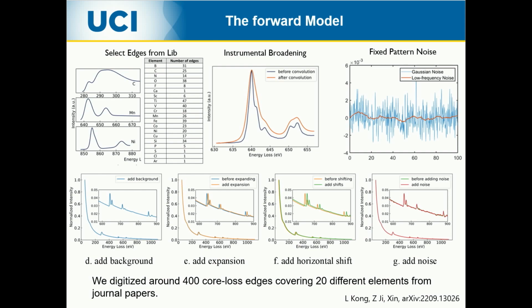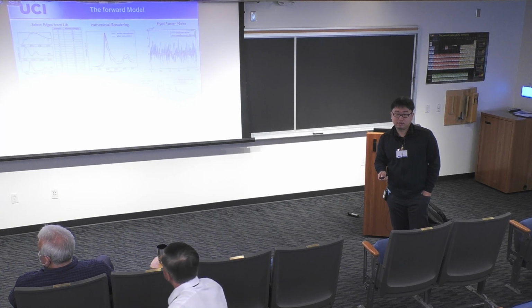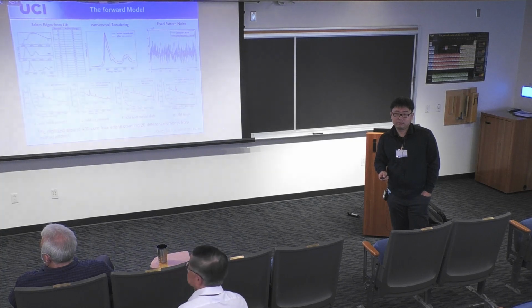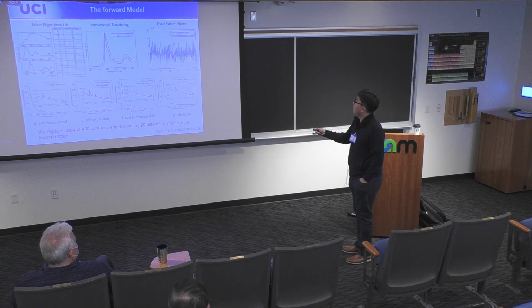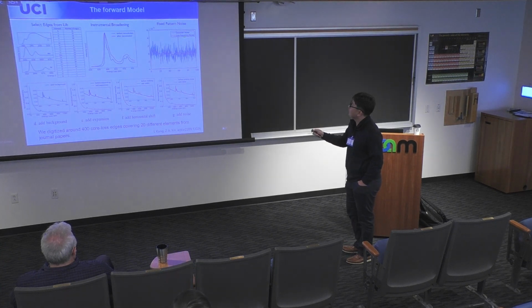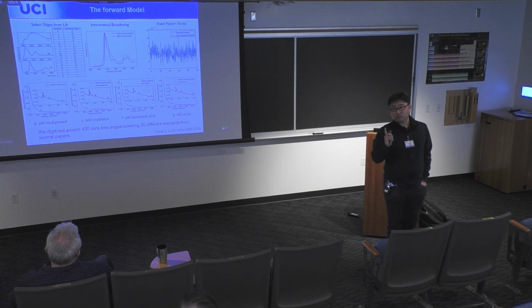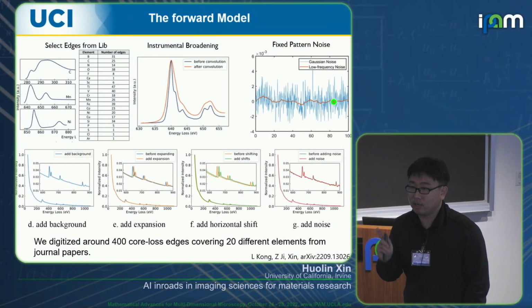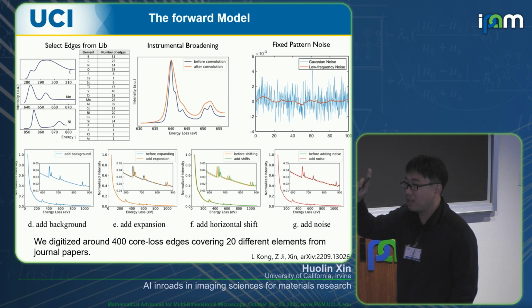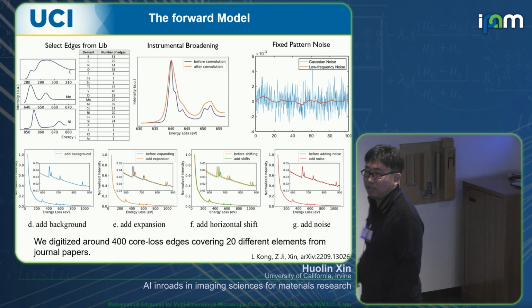Yes. Whenever I have calibrated the noise in any detector at all, it's always dominated by something that scales as Poisson noise, including spectrometers. For this one, I didn't even include the Gaussian noise. I only included the low-frequency noise in the augmentation of the spectra, and there's a reason for that. This network is really deployed for survey spectra, just like XPS. I want to survey a spectrum and know what edges I have.